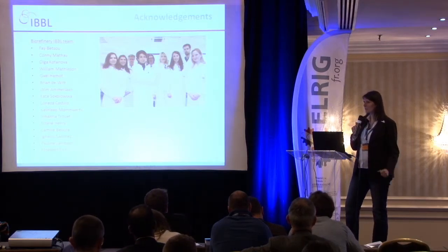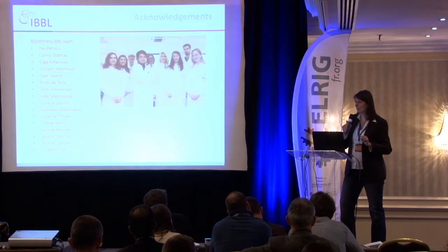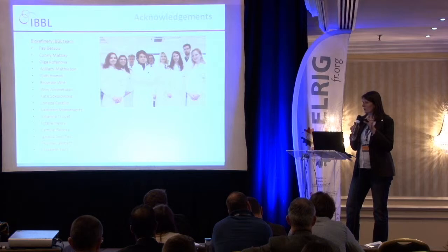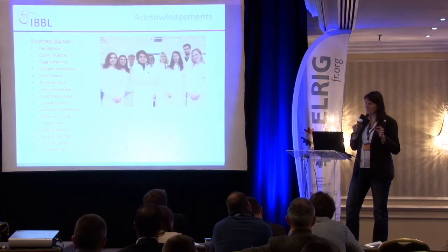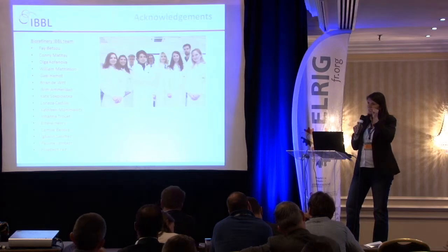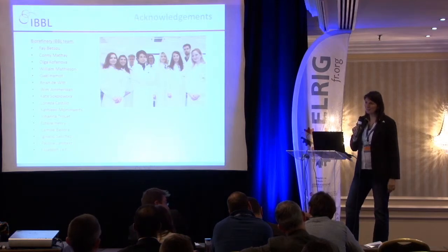But for us, because we do DNA extraction afterwards, it's not important if it's what they call a dirty buffy coat, meaning that it's contaminated with red blood cells. Actually, it's looking quite red afterwards, but for us this is not important, so it can just continue. If there is really a small amount of buffy coat, it can also pipette some white blood cells, as long as we have the white blood cells in there to do our extraction afterwards.